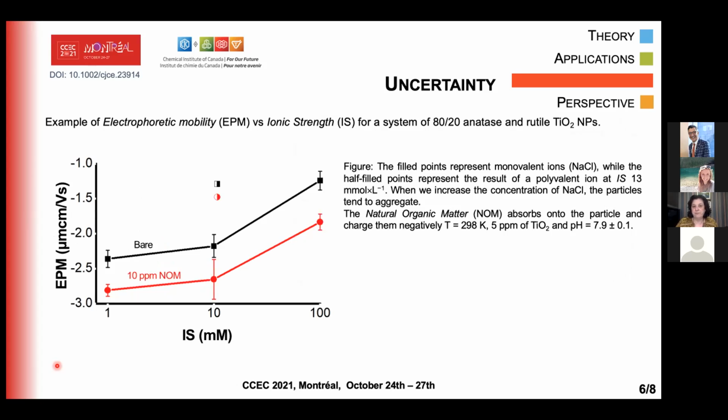Another important piece of information is when we look at electrophoretic mobility versus ionic strength. In this case, we used 80-20 anatase and rutile titanium dioxide nanoparticles.